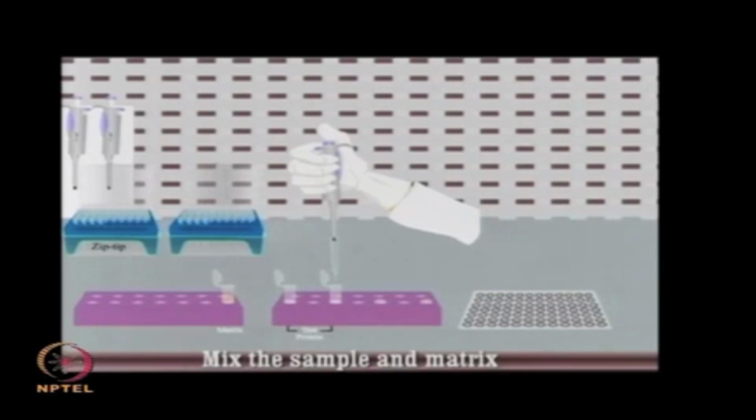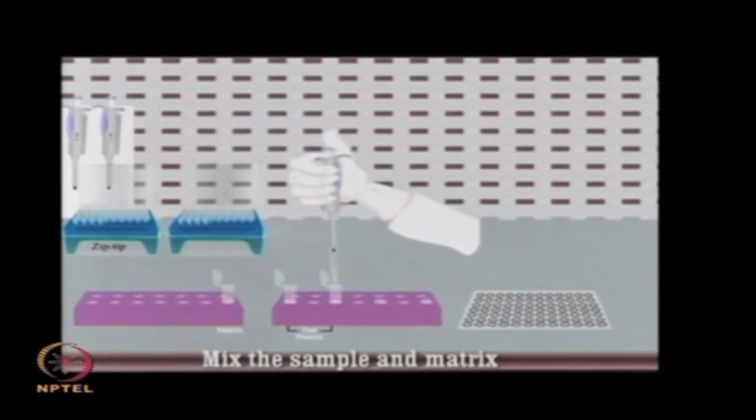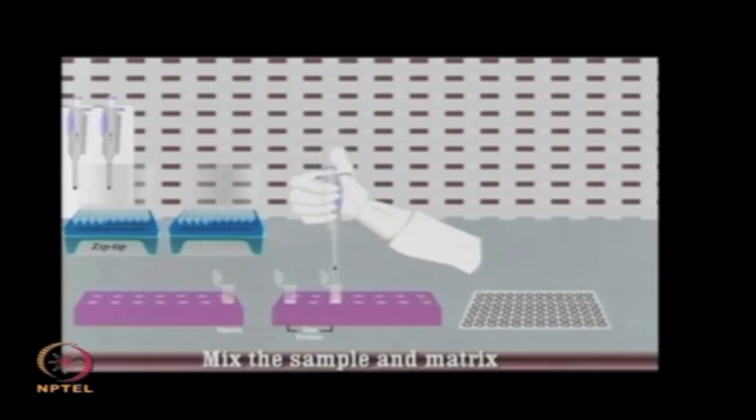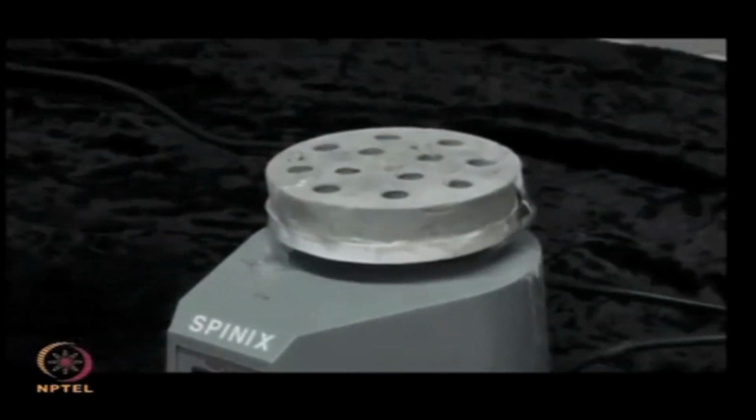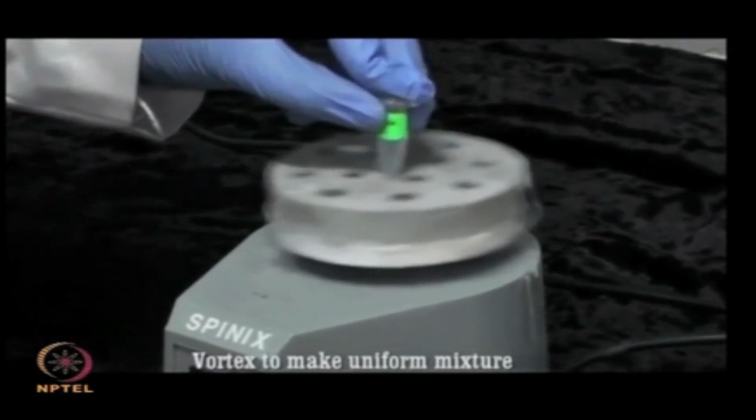MALDI is performed in two steps. In the first step, the compound for the analysis should be dissolved in a solvent containing small organic molecules known as matrix.